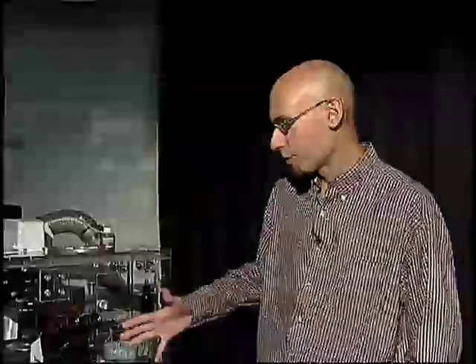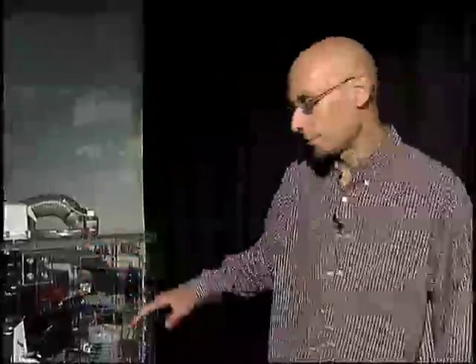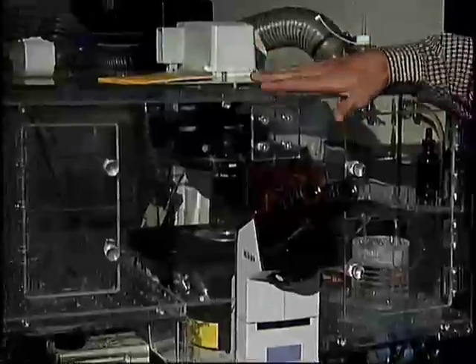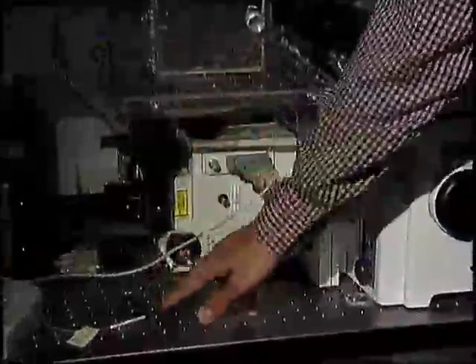This is our spinning disk confocal here in the Nikon Imaging Center. You'll notice this system is mounted on an inverted scope, and there's a plexiglass box on here for temperature control of live specimens. You can do imaging of live cells on here, since spinning disk confocal is particularly good for live cell imaging. The confocal itself is this box right here. This has an optical fiber that connects it to the laser launch that provides the illumination for the confocal.